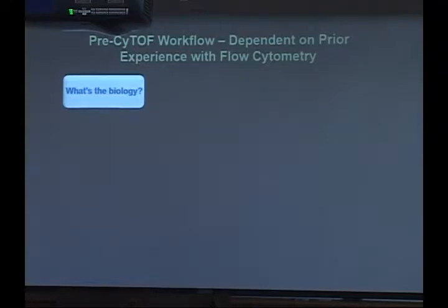So, as I mentioned, the workflow of fluorescence and mass cytometry are very, very comparable. What's really nice, if you don't have a CyTOF but you have a collaborator, what's really nice and helpful to everybody, especially to you, is to perform as much background experimentation as you possibly can, because chances are that the things that you see by fluorescence will be directly transferable to mass cytometry.